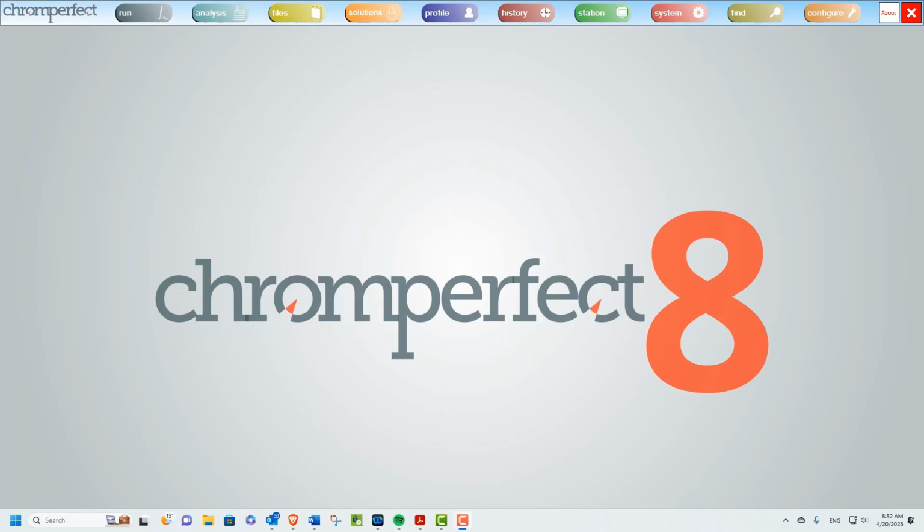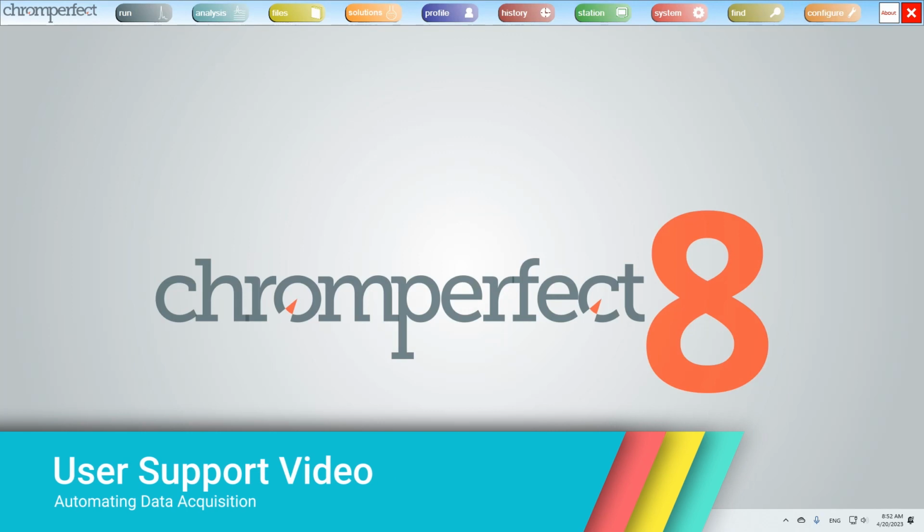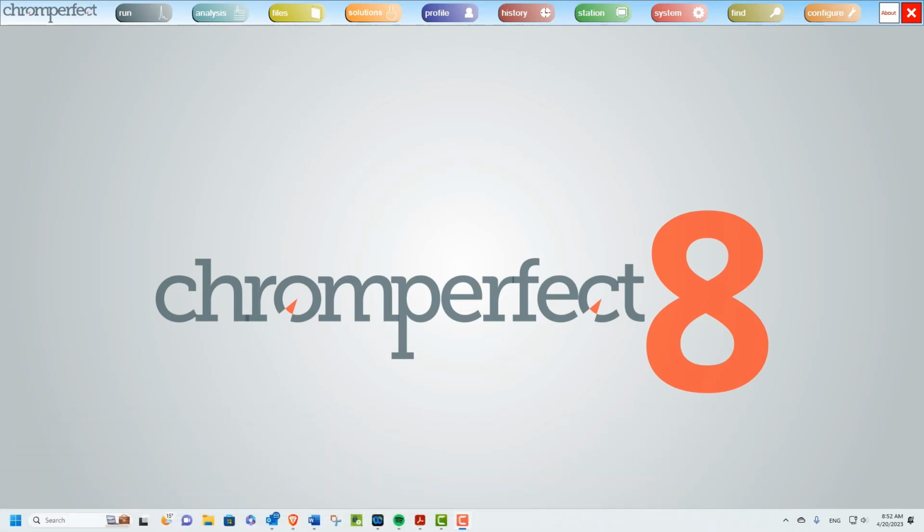Welcome to this brief user support video which will explain how Chromperfect can be configured to automate chromatography data acquisition. This can be to automatically repeat a sequence file or to continuously and automatically start the acquisition at the end of every run. In this video we are using Chromperfect version 8 and Windows 11. Other versions and operating systems may behave differently.